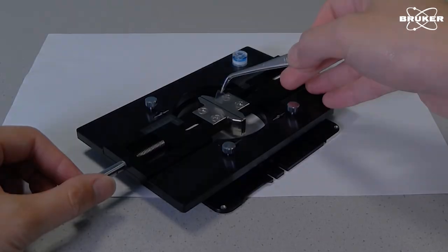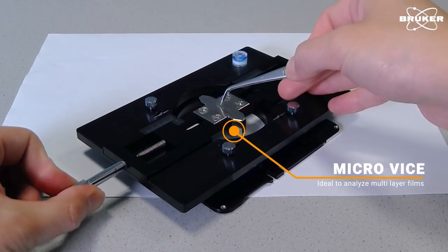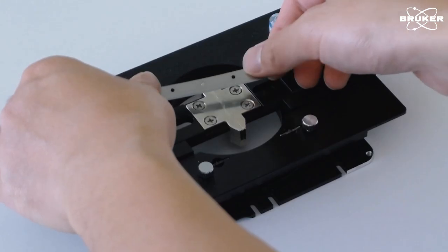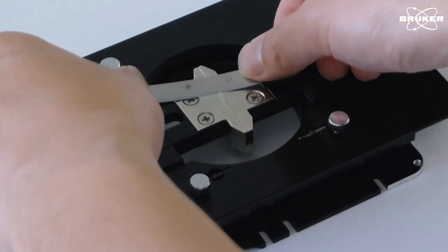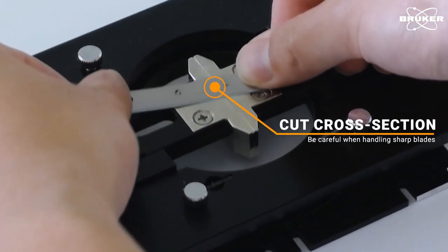To start, the multilayer film is placed in a special holder and a fresh cross-section prepared with a very sharp blade.